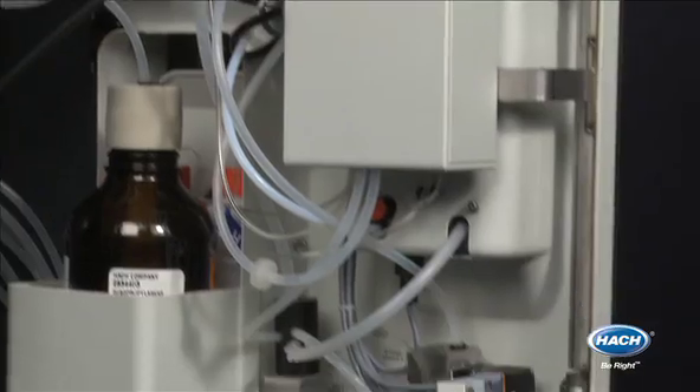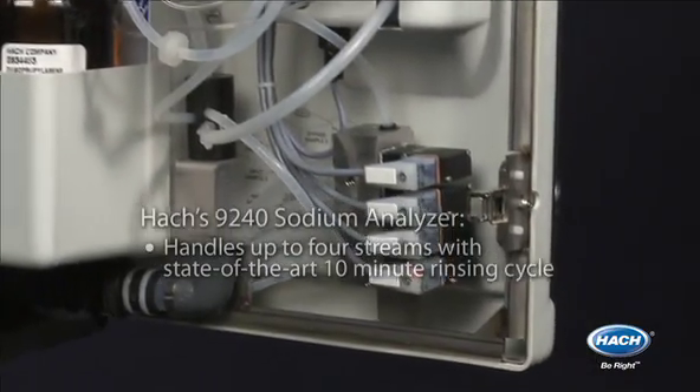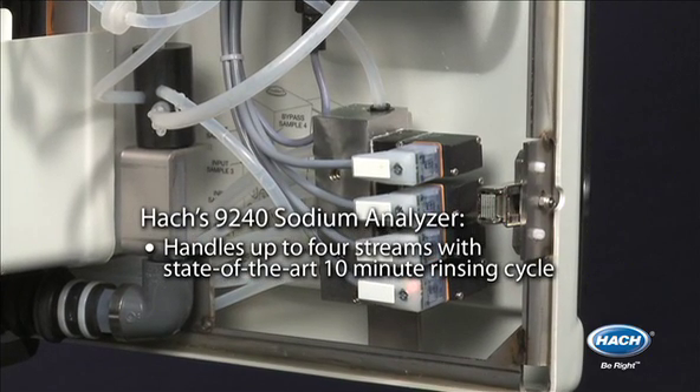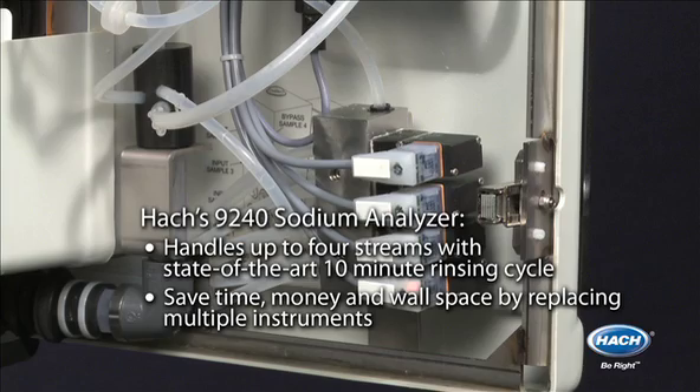The 9240 also significantly reduces your cost of ownership. It is capable of handling up to four different streams with its state-of-the-art 10-minute rinsing cycle. With just one instrument, you can save time, money, and wall space.